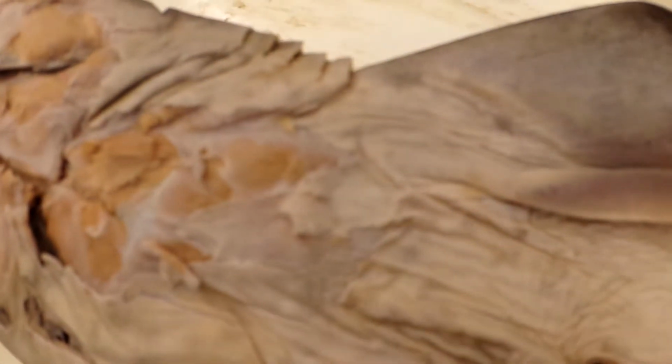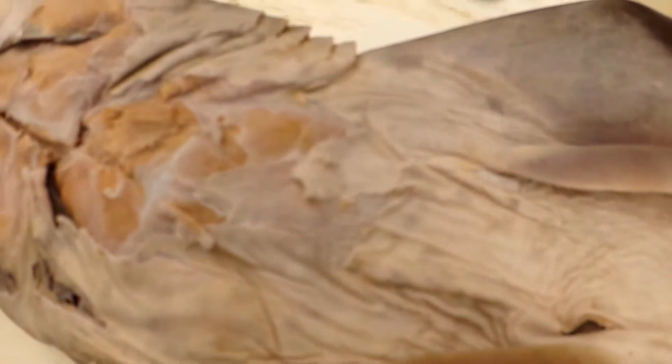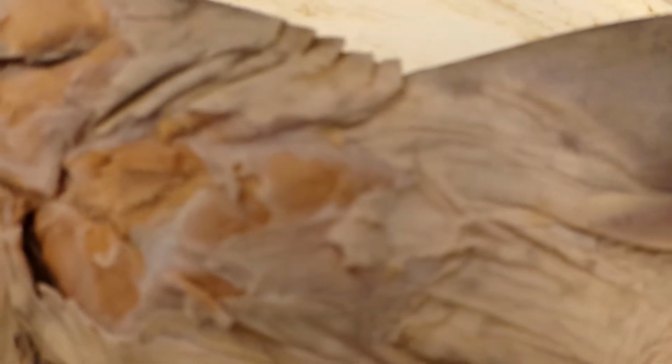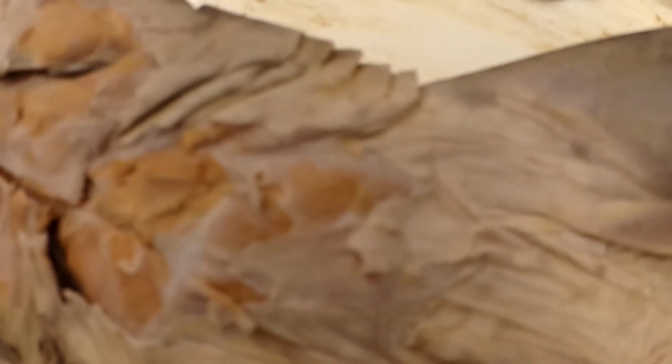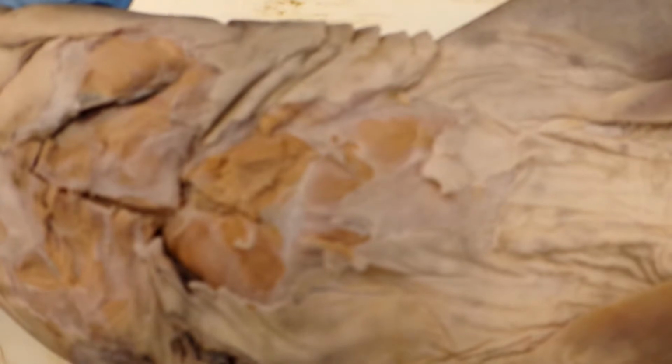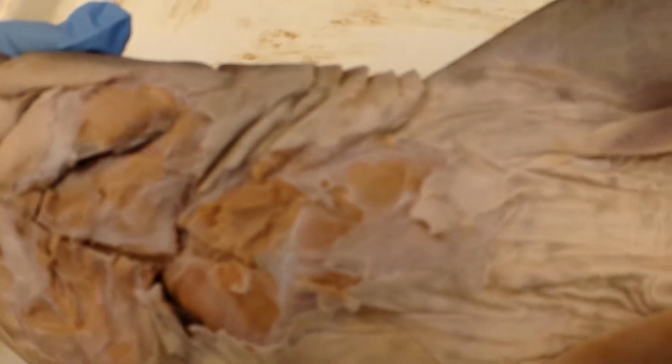And the pectoral adductors are located in the same area, and its origin is the coracoid bar of the pectoral girdle. Its insertion is the pterygiophores, and it's homologous to the pectoralis, coracobrachialis, humeral, and brachialis forearm flexors.